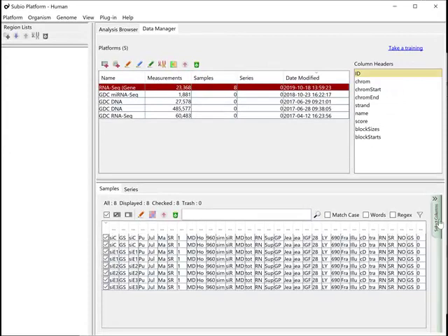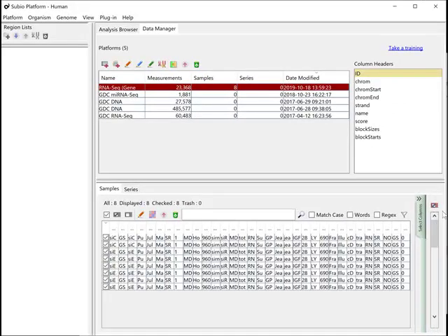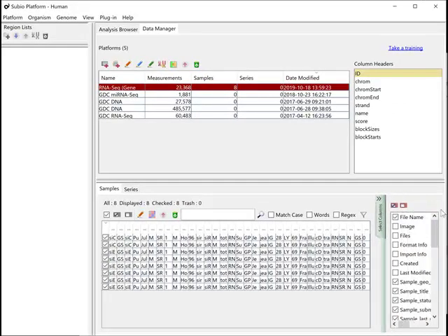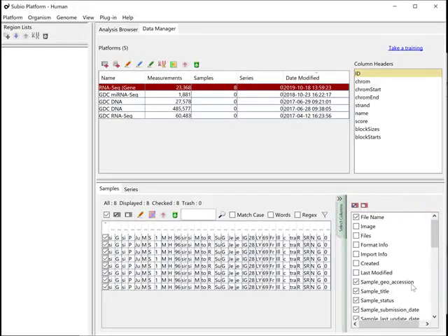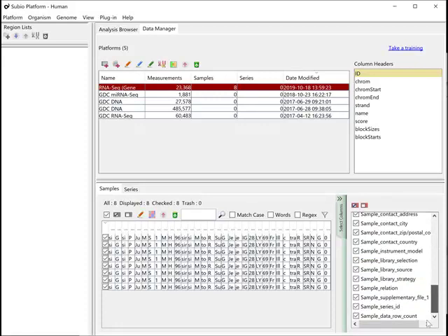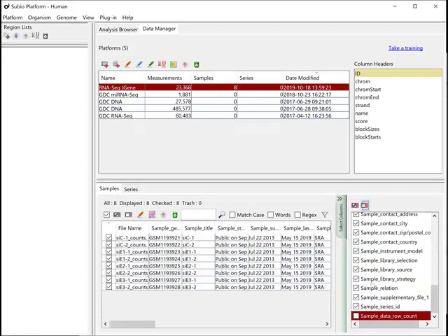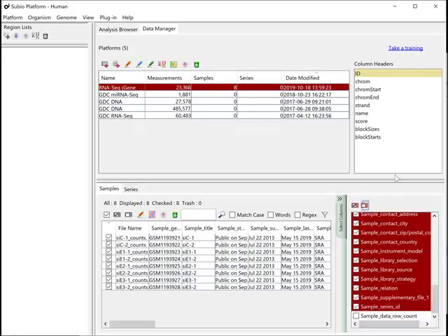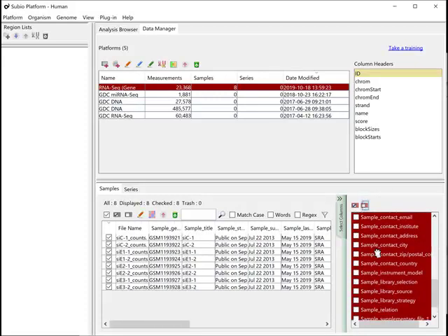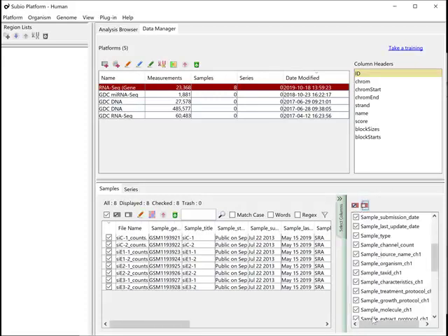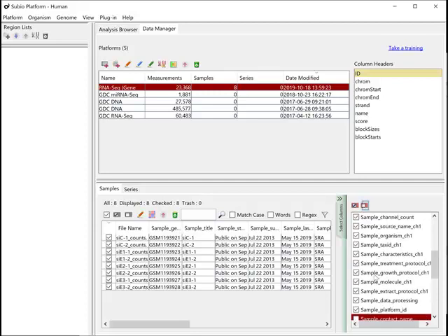You can choose columns to show or hide. I recommend you show these four columns in general.